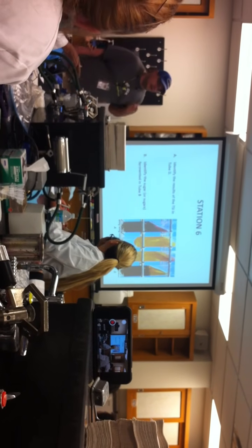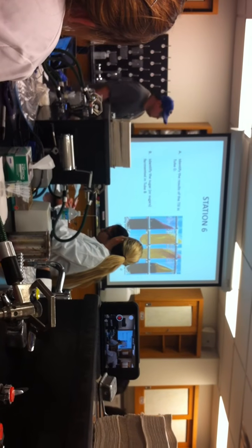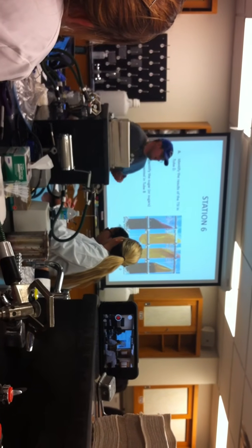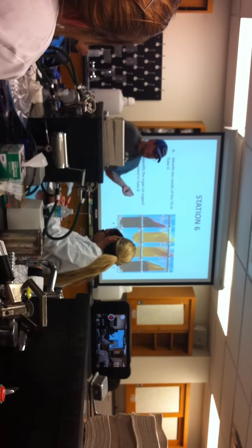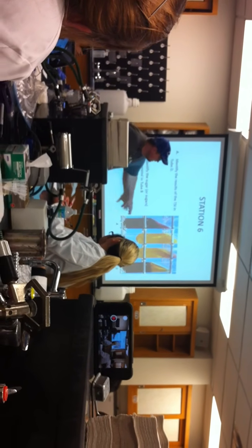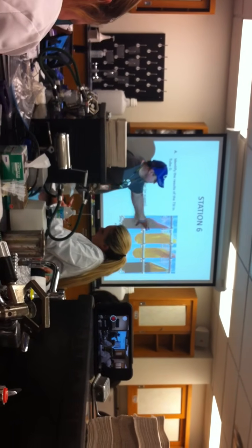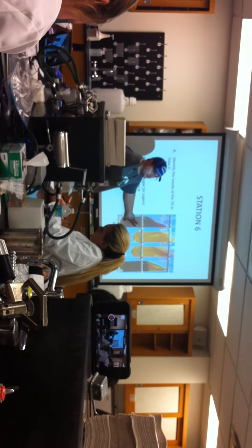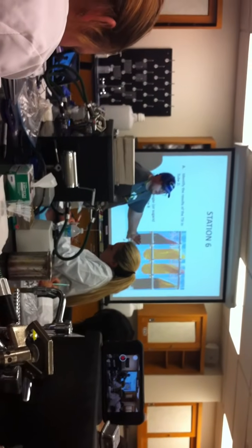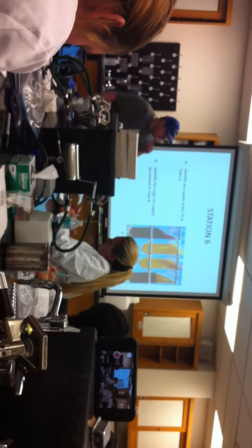Remember what kind of sugars are present. Now, I told you the specific types on the PowerPoint. However, I would be willing to take the slant has disaccharides, so 2-part sugars, and the butt is just a 1 sugar, glucose, just a single sugar. Okay? So disaccharides over single sugar. Okay? Does that make sense?